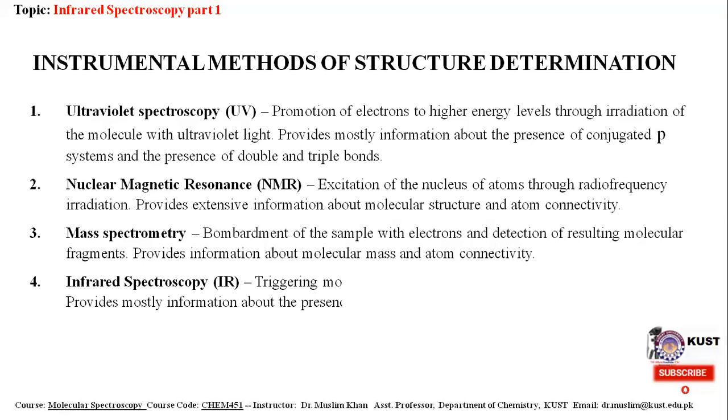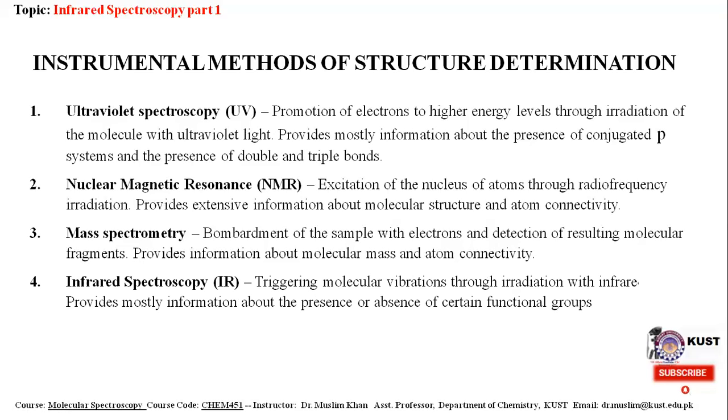The next one is infrared spectroscopy. In today's lecture, we are focusing on IR spectroscopy. Basically, in this spectroscopy, IR radiations are used for triggering molecular vibration through radiation with infrared light. It provides mostly information about the presence or absence of certain functional groups.